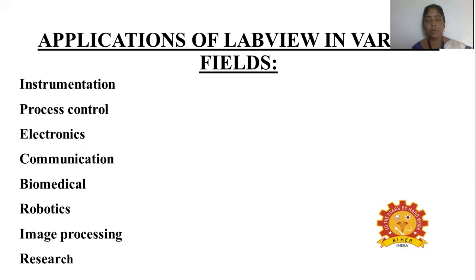When we talk about how a reaction is being carried out, whether the reaction is being carried out in an efficient way can be monitored with LabVIEW software that has been run in an automatic control group. So this LabVIEW can also be used in various research fields.